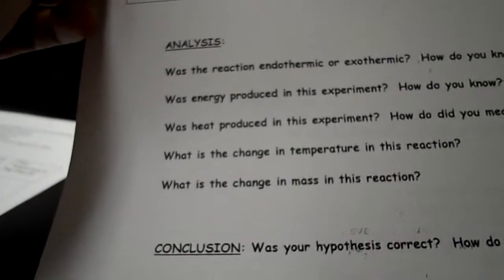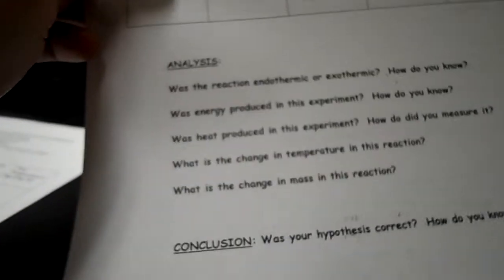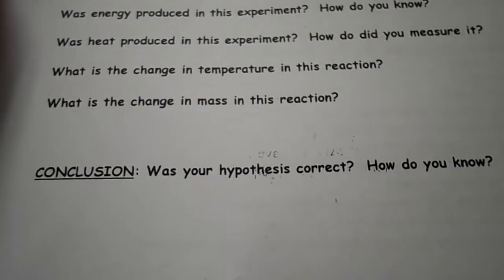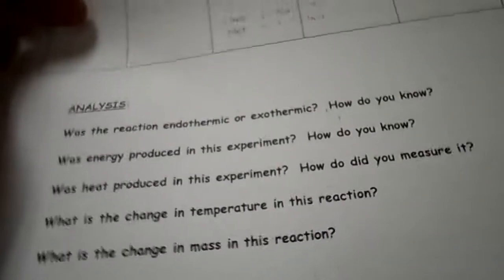What is the change in temperature, and what is the change in mass? So those will come from your data table. Okay, now you did take a hypothesis at the beginning of this, so just let me know were you correct, and how do you know?